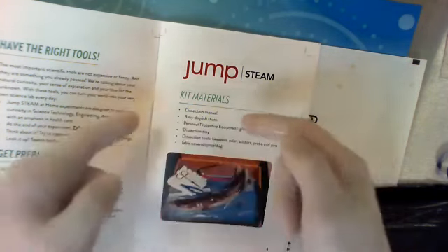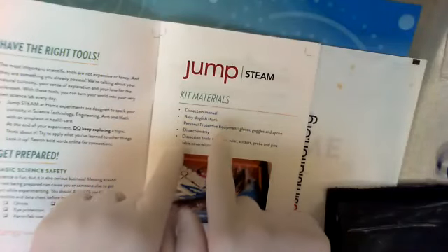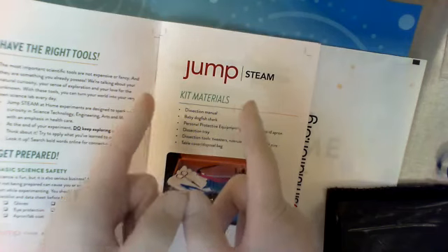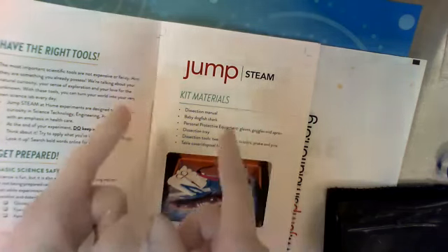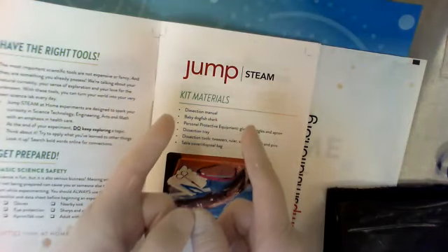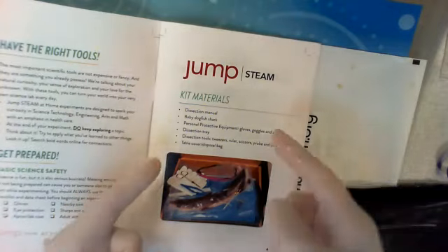You have the dissection manual, which we're looking through. You have a dogfish shark. It's not a baby. It's actually over 2 feet long. The babies are little guys. We originally started with baby sharks because it was funny just to say baby shark. But we found out they're too small to dissect. So now you have 2 foot long plus sharks, which are awesome.